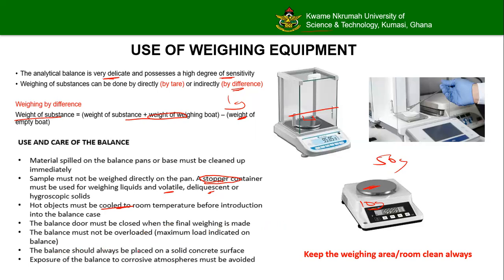Now, we are saying the balance should always be placed on a solid concrete surface just to prevent it from falling down and then breaking. Now, we are saying that exposure of the balance to corrosive atmosphere must be avoided.